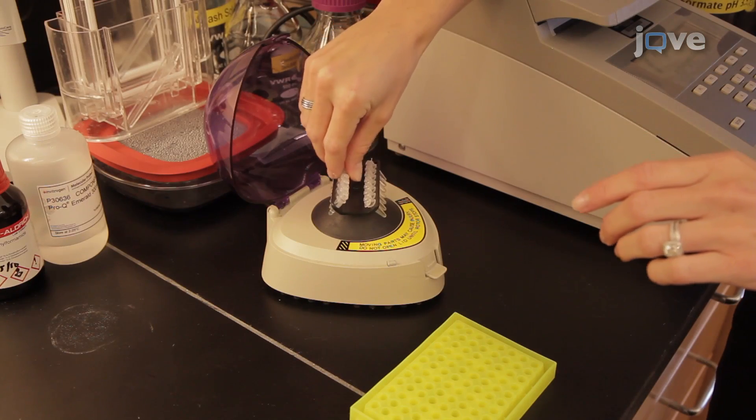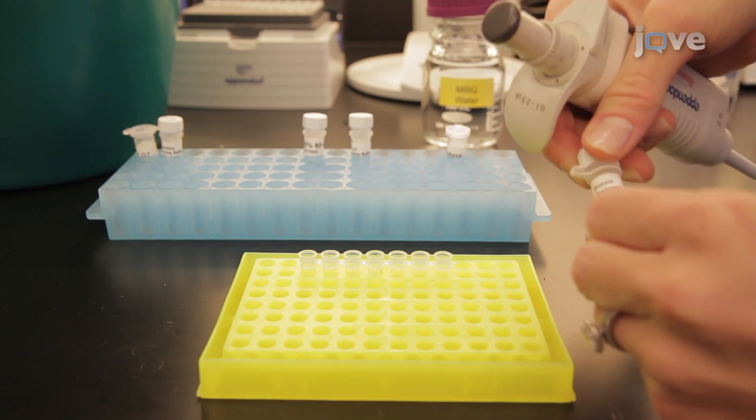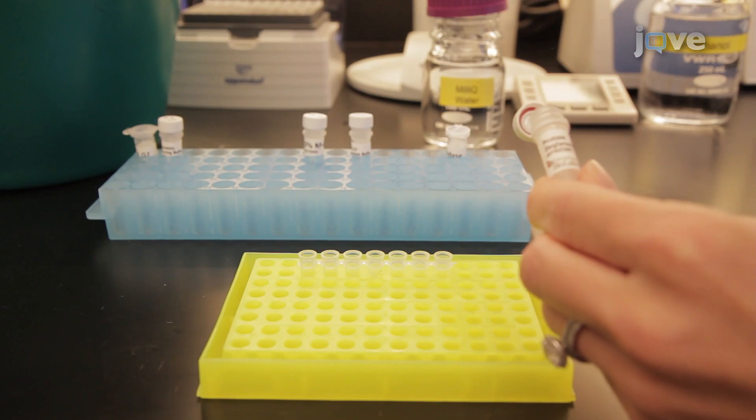After removing the tubes from the thermocycler, centrifuge to remove any visible condensation. To each reaction tube, add the remaining reagents according to the written protocol.